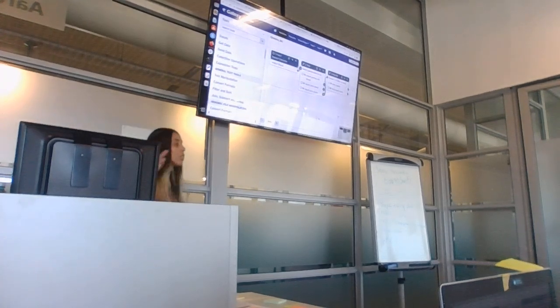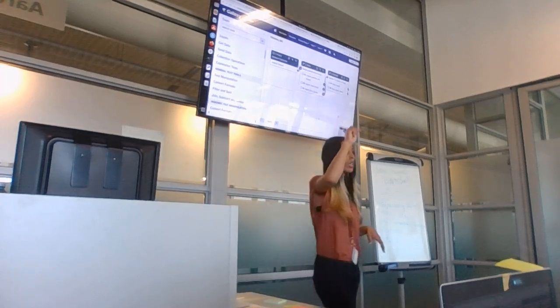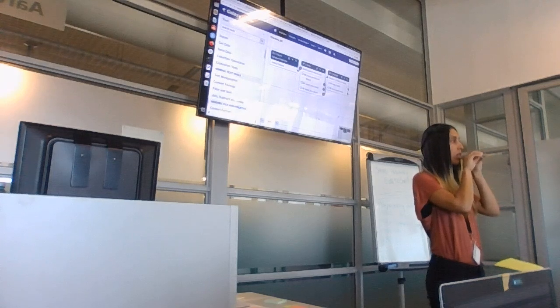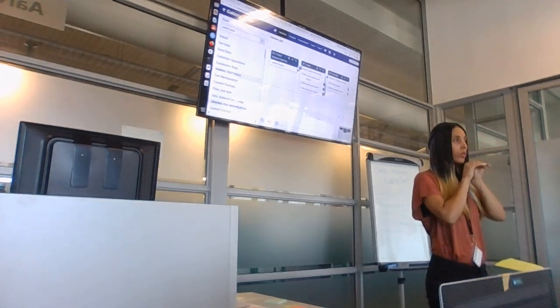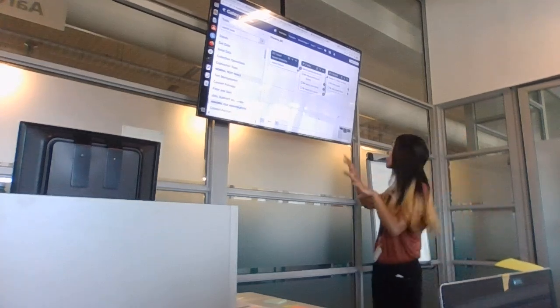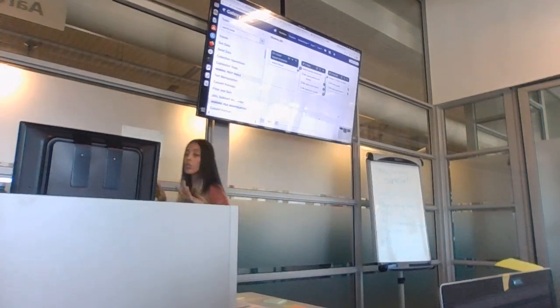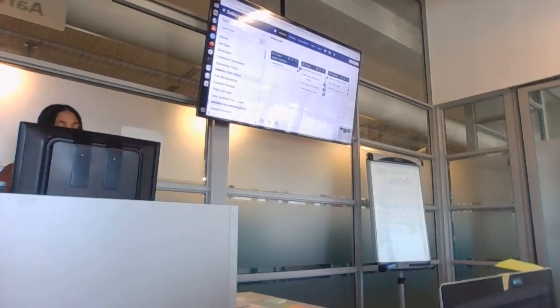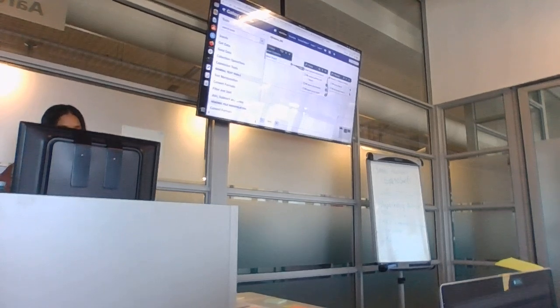If you click on the workflow on top and then you click on the name of the workflow that you just created, and you go down to the bottom, the first one I think that says edit, you should see this view that shows you what you did, what your workflow looks like. You have a dataset collection as input. It feeds that into FastP. Now you can here also click on FastP.